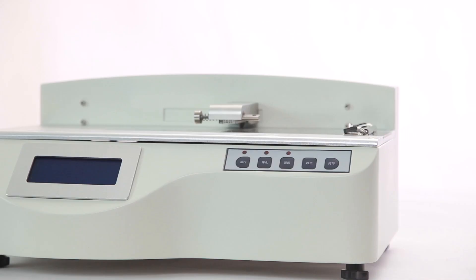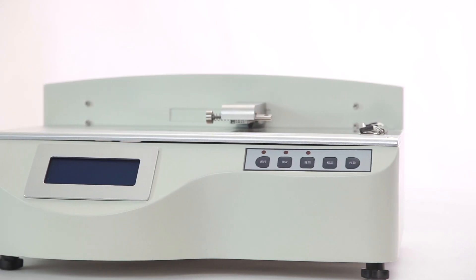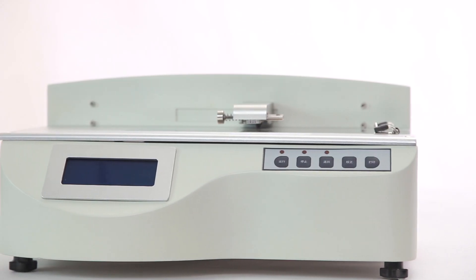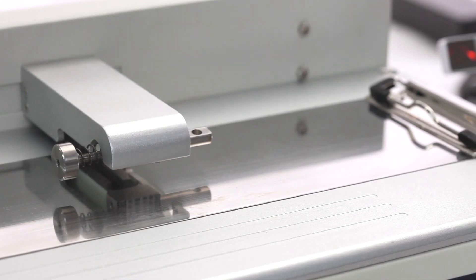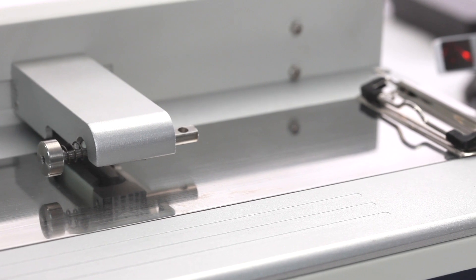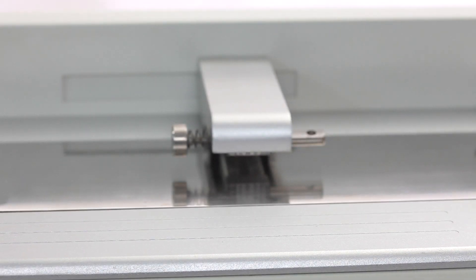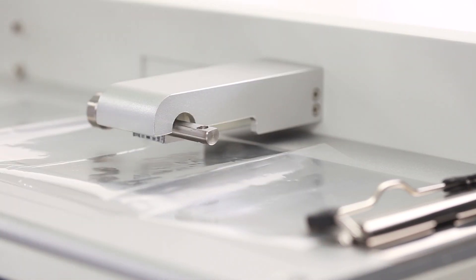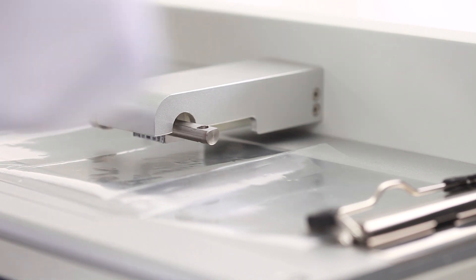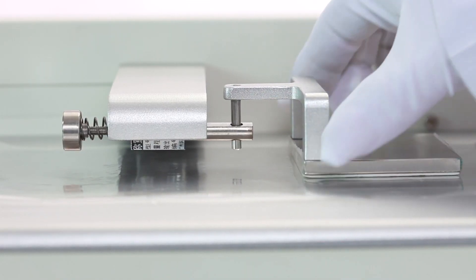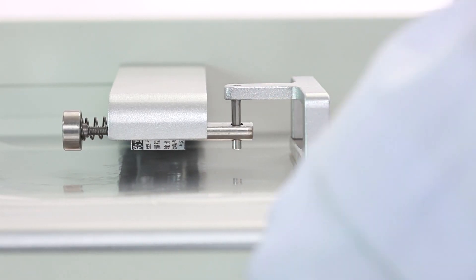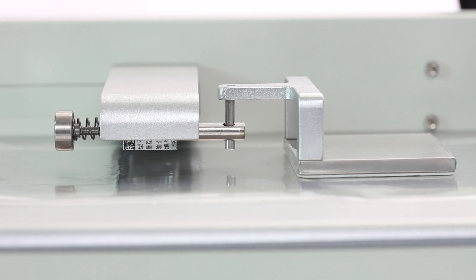GM1 and GM4 coefficient of friction test to test the static and kinetic coefficient of friction to evaluate the smoothness and deepness of plastic film, paper and other materials used in the industries of packaging, plastic film.